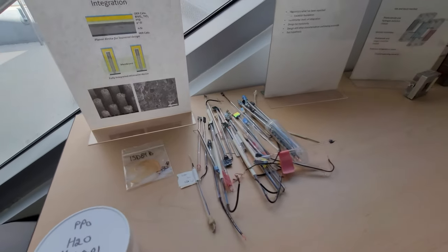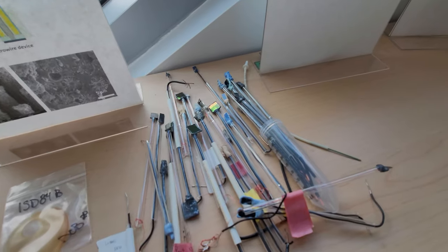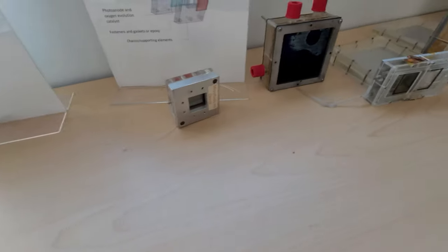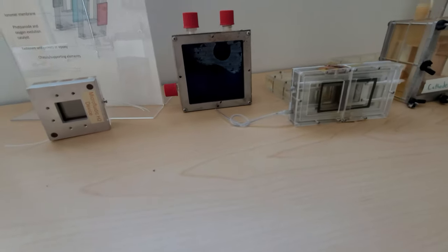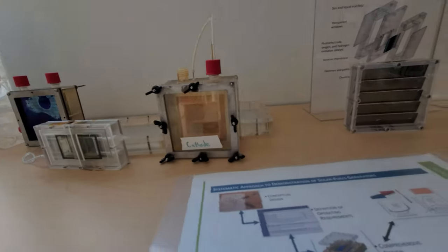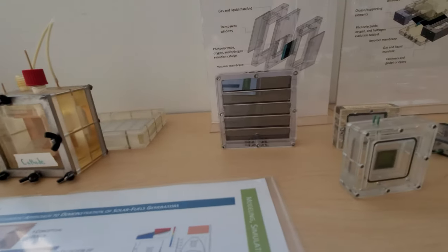And finally, we arrive at the prototyping lab where the materials being developed - semiconductors, membranes, and catalysts - having been tested piecewise are brought together into various chassis to evaluate compatibility, efficiency, and stability in long-term indoor and outdoor testing environments.